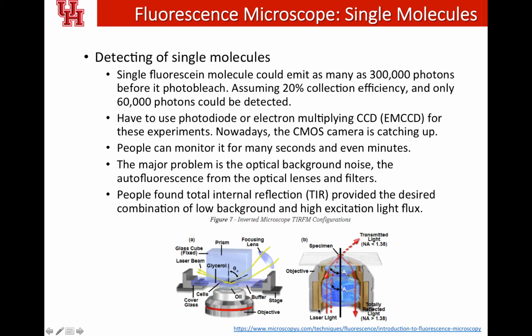So you have the excitation filter and emission filter on the bottom of this objective, and you do everything the same except this excitation. So now you have this evanescent wave on top of this glass slide, and you have cultured cells on top, and the entire space on top of your glass is now open, so you can do many things on top, right? You can add your samples, you can patch clamp your cells. So this is obviously a much more user-friendly architecture for this TIRF system. So that's what most people use nowadays for the TIRF microscope.